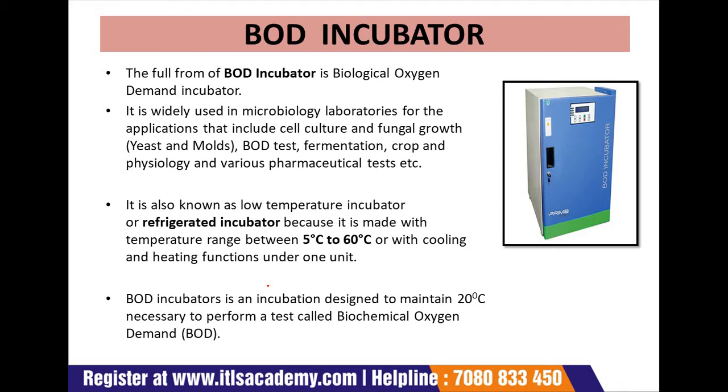BOD incubators, often called low temperature incubators, are among the most important lab equipment in many research centers, hospitals, and other pharmaceutical labs. The full form of BOD incubator, as we know, is biological oxygen demand incubator.